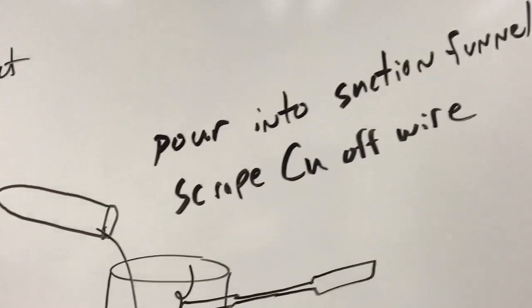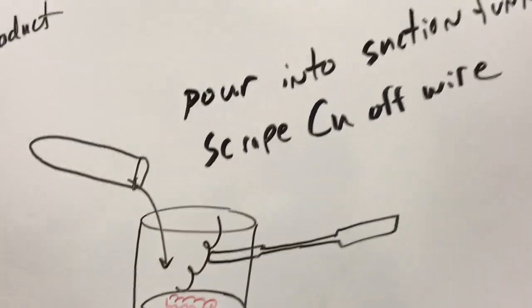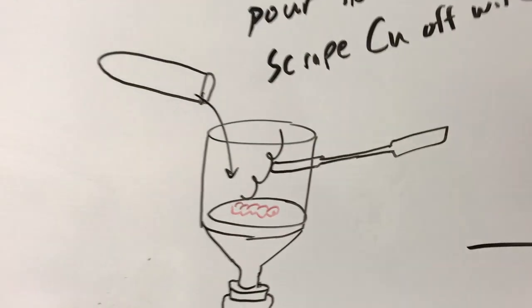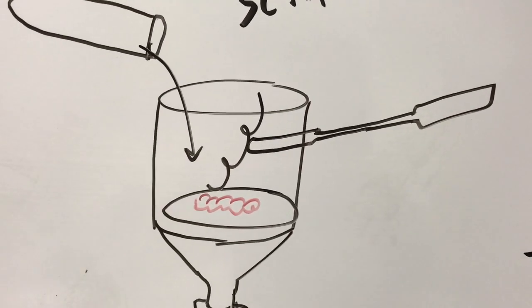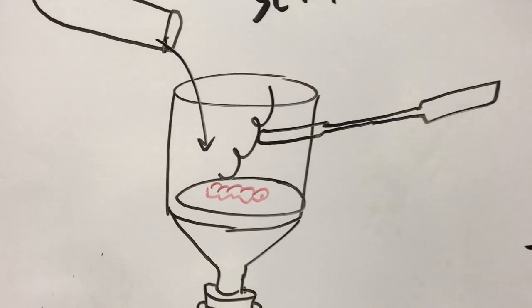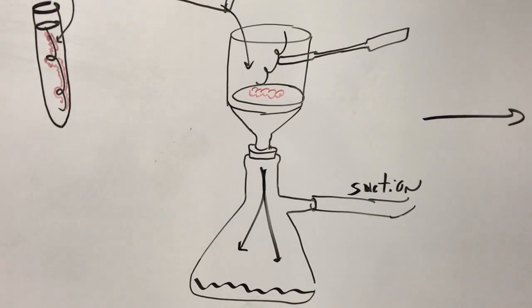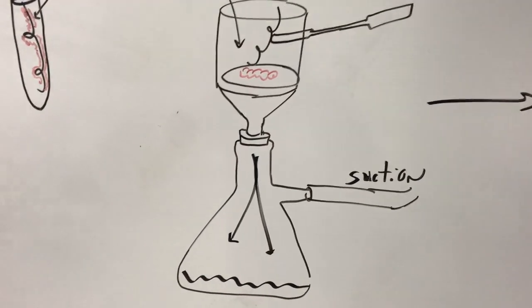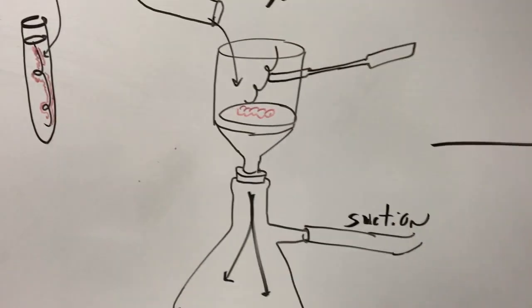Then we're going to pour the contents of the test tube into a Buchner funnel, which is on a suction flask, and we're going to scrape off all of the solid copper off of the wire, and try to catch all the solid copper onto the filter paper. Now the rest of the liquid is going to flow to the bottom of the flask, and we're not concerned with that anymore. We just want the mass of the copper.